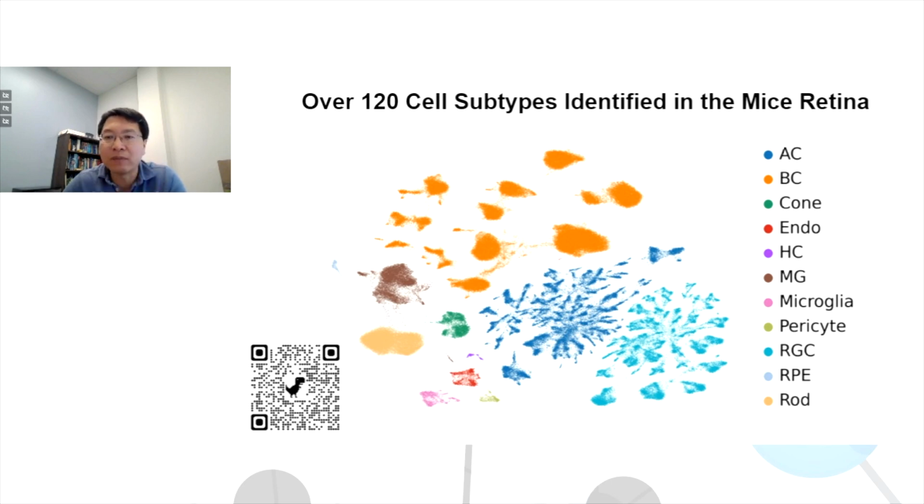But as Daniel mentioned before, there's major information missing, and the limitation is because this is from 3' RNA-seq, primarily from the 10x Genomics data. Therefore, we really don't know the isoform. And we know isoform is important during development of the retina. There's significant isoform switch during development, but we also know that neurons actually use a different class of isoforms to basically build up the map. So isoform has been known to play an important role in development and function of this tissue.